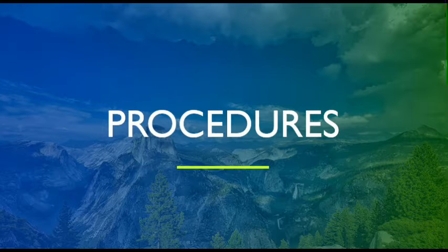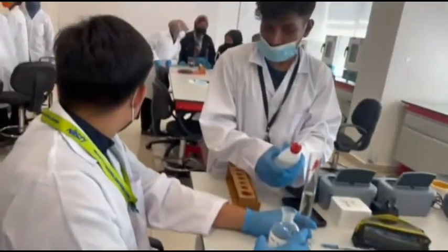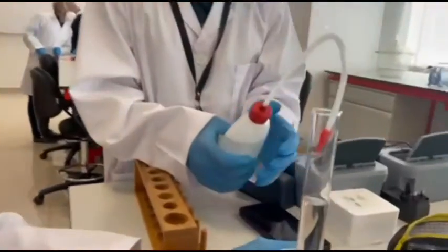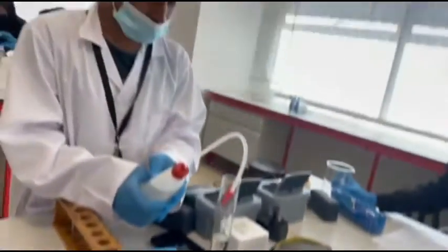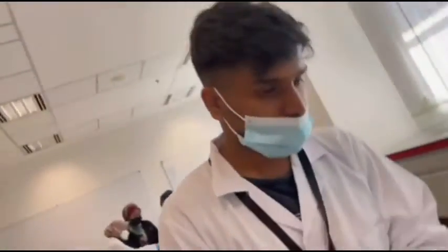The procedure for the BOD test: first step, collect the sample. Second step, measure the pH of the sample, in the range 6.5 to 7.5. Next, determine the sample size using equation A and equation B.